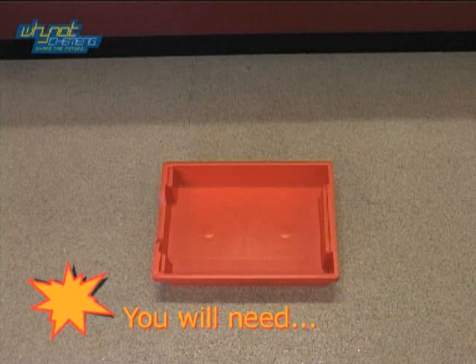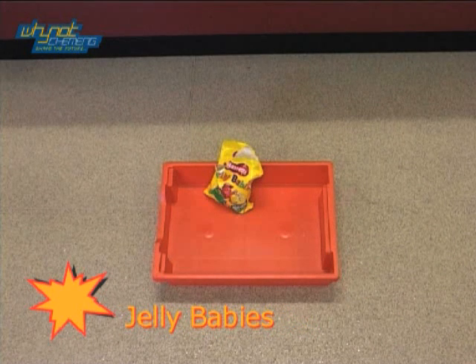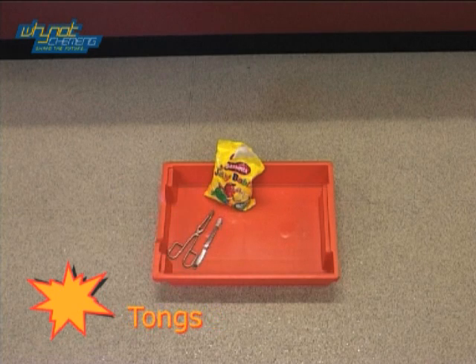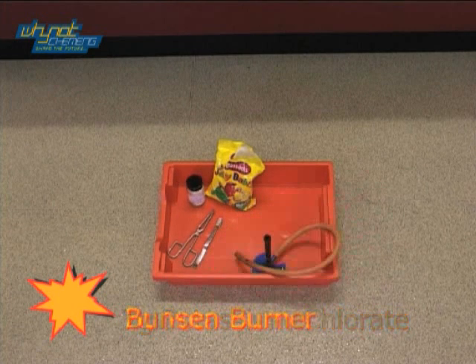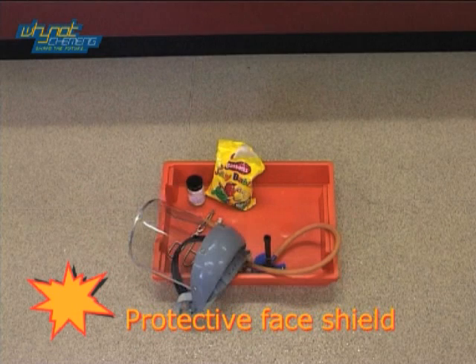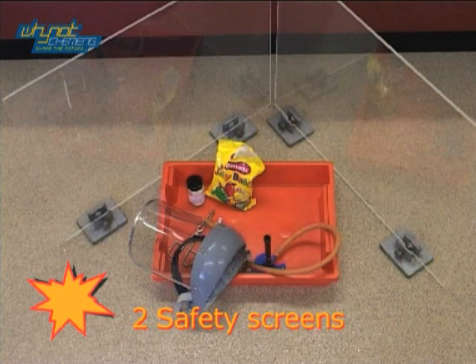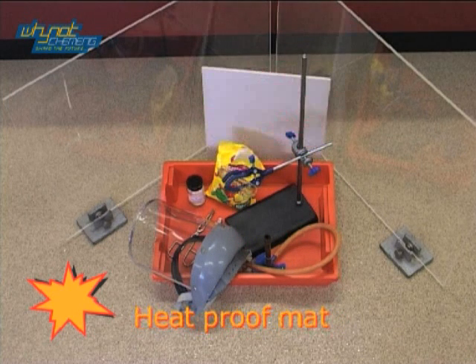For this demonstration you will need: Jelly Babies, a spatula, tongs, 7 grams of potassium chlorate, a Bunsen burner, a protective face shield, 2 safety screens, a clamp stand, and a heatproof mat.